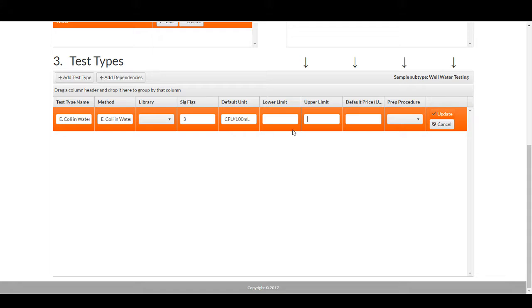The default price field is used by Limfinite to charge customers via the customer portal. This is also an optional field. It will be needed if you choose to use the payment methods available through limfinite.com. For this example, we'll just set the default price to $30.